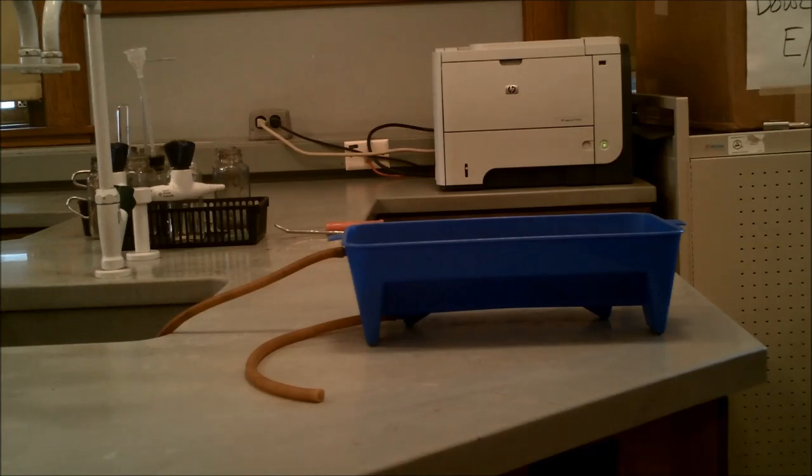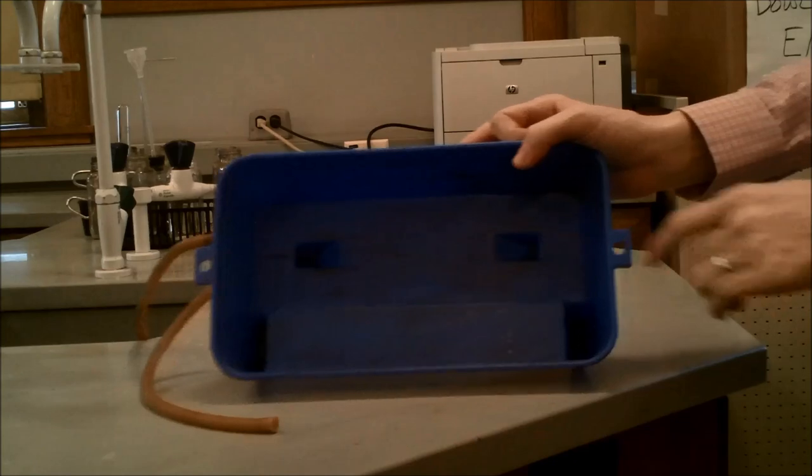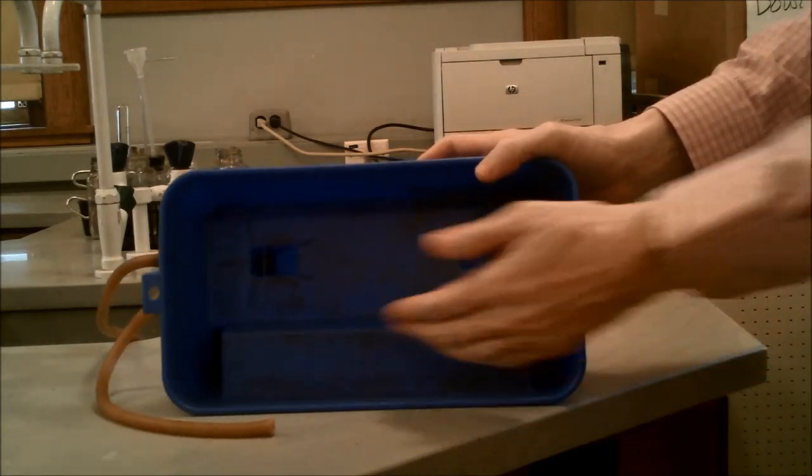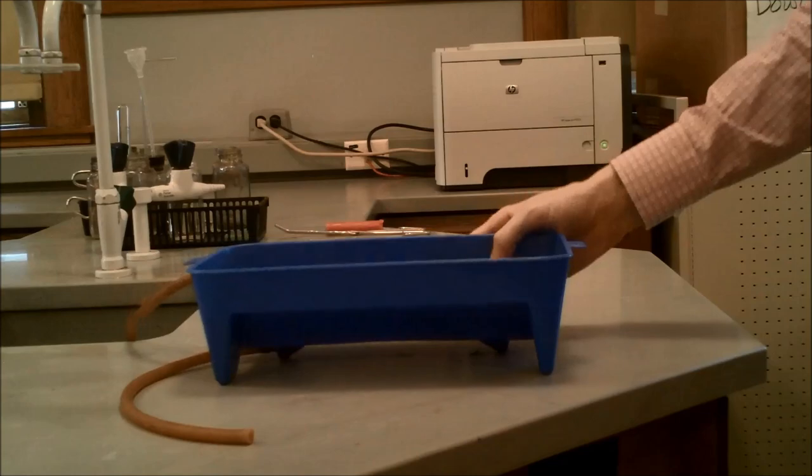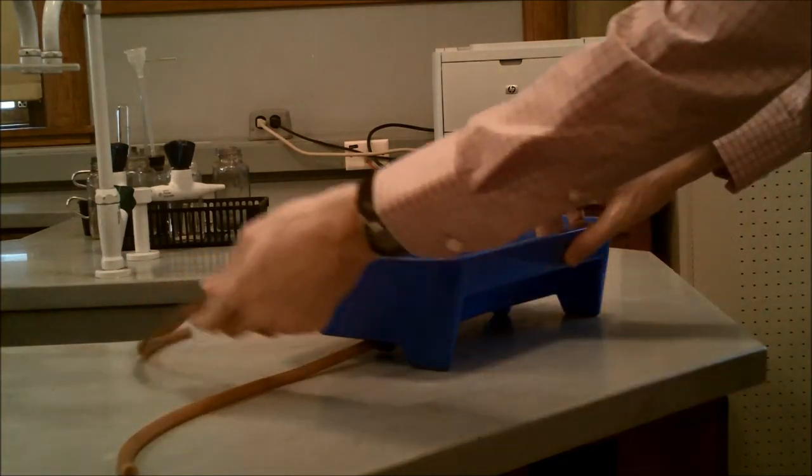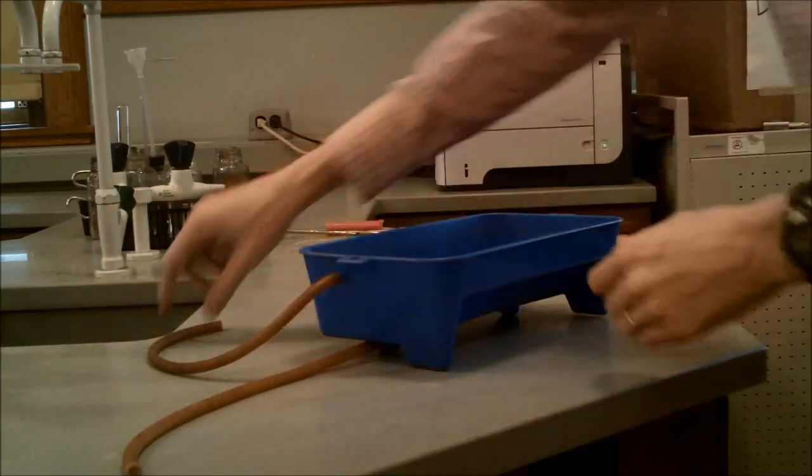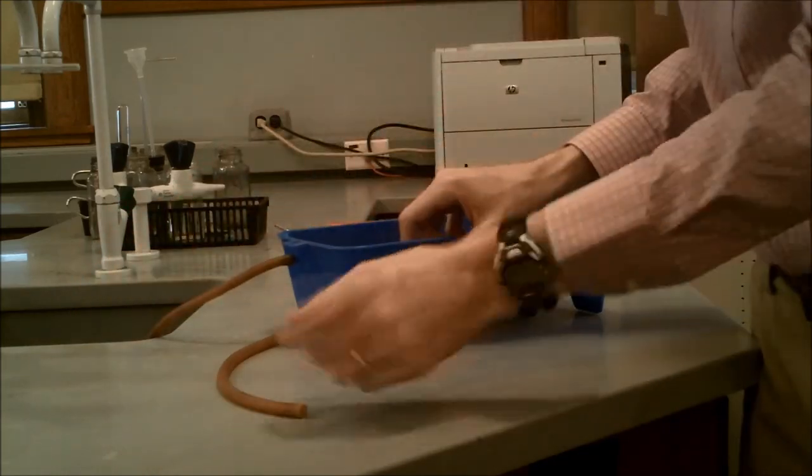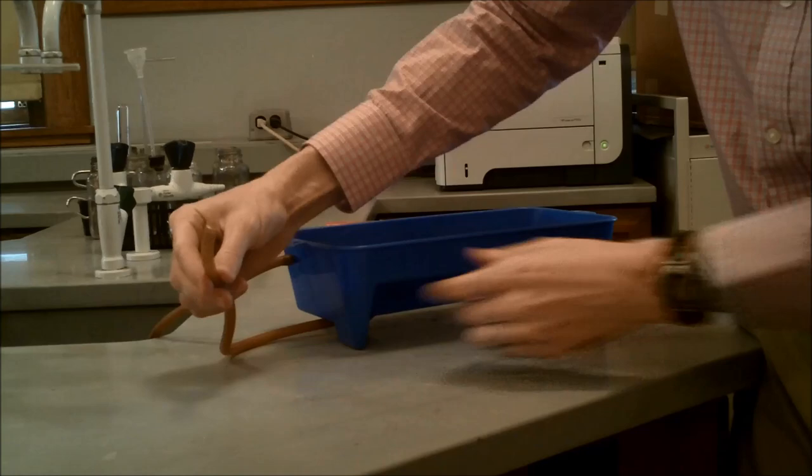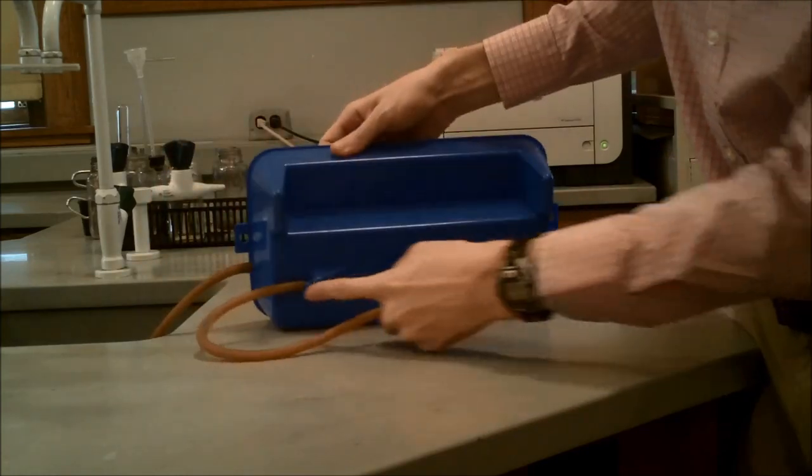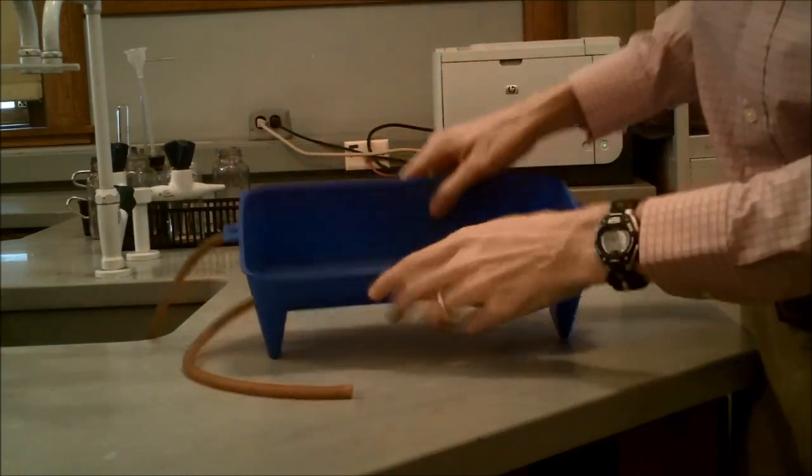The first thing is the gas collection trough, which is this blue thing. Inside of it you'll see that there is a shelf right there. Also there are two tubes attached. The one on the top is for draining of the water if you fill up too much, which will be in the sink. The one on the bottom will be connected to the reaction chamber, which also is connected to a hole at the bottom of the trough, which will allow the gases to bubble up.